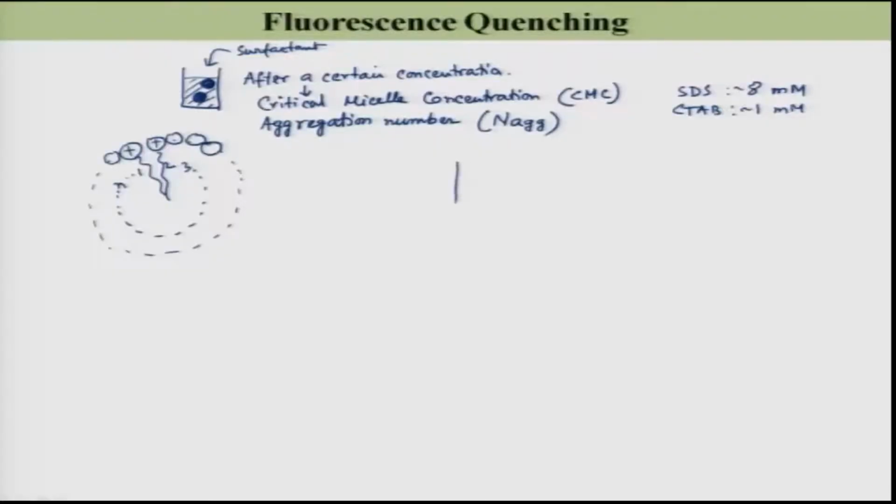For the measurement of the CMC, you see the situation. I have a solution, let us say this is water, and let us take one fluorophore inside this water with some concentration.